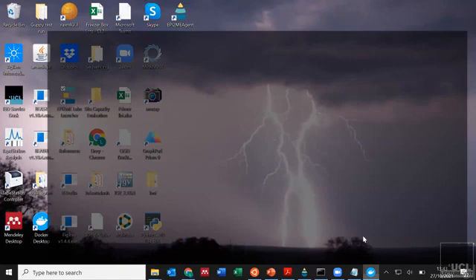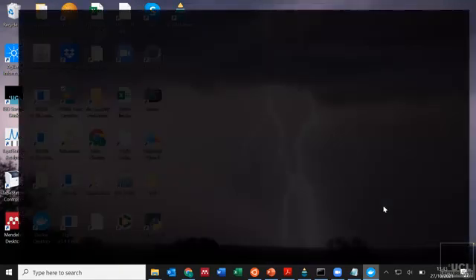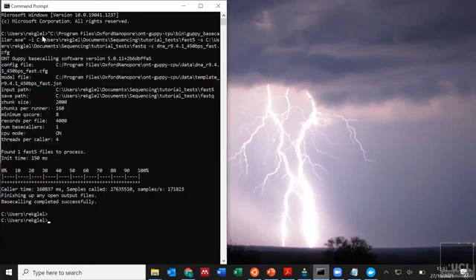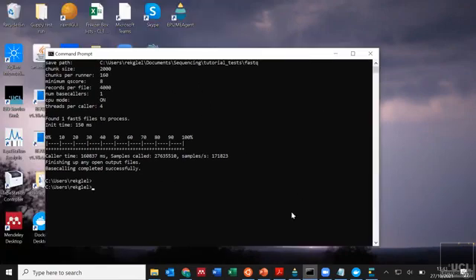It's really nice, actually, Lindsay, that you showed us both how to do it with Ubuntu and Windows. Does that mean you're running both? You've got an Ubuntu laptop now? Yeah. So okay. No, I've got a Windows. This is what the WSL is, the Windows subsystem for Linux. It's easier if you have a Windows computer to run Windows, because you can just, as I say, copy and paste file paths in.